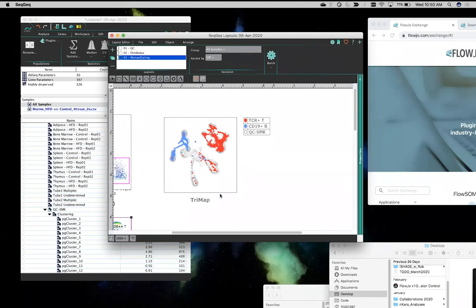You're going to have a much harder time getting clear separation when you're gating on transcriptome features or RNA parameters or genes. So that's one of the downsides to RNA, that it is not usually giving you a very clear-cut bimodality between populations. At least that's been my experience. Particularly, you're going to have a lot of false negatives.